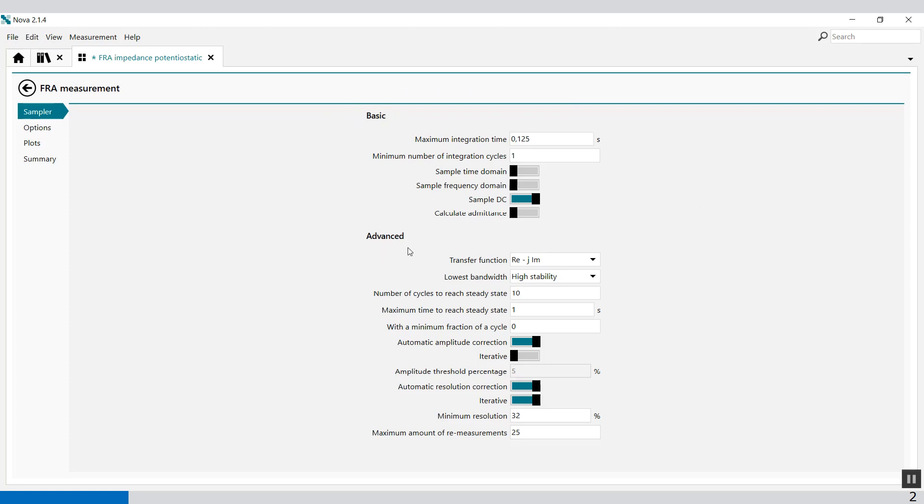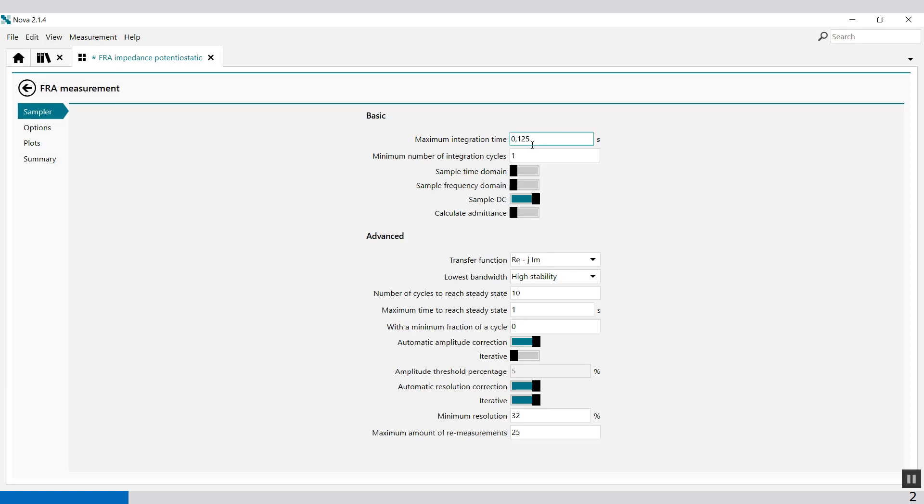I'm only going to discuss the basic functionality, because the advanced functionality you have to look in the user manual for details about that. The basic functionality, for example, the maximum integration time. This defines the longest time in seconds during which the AC response of the cell is recorded for data analysis. Long integration time values increase the duration of the measurement but improve the signal-to-noise ratio. The default value is 0.125 seconds.